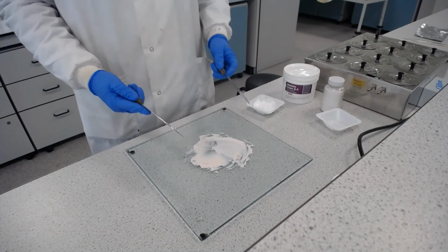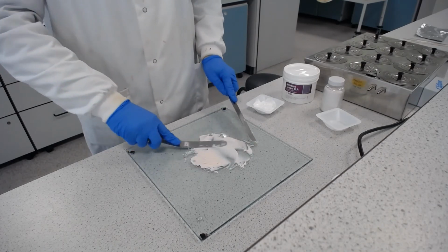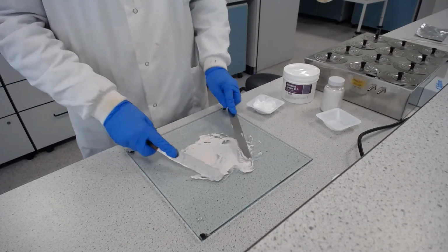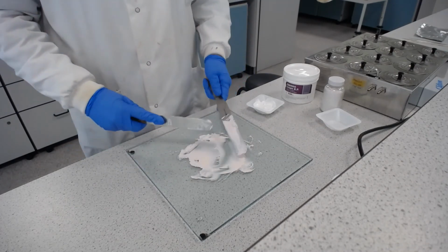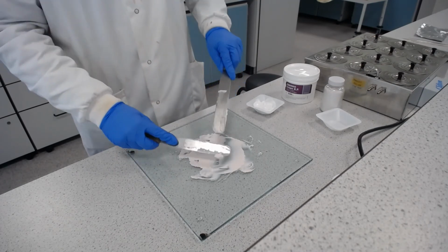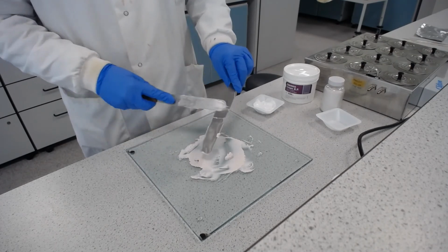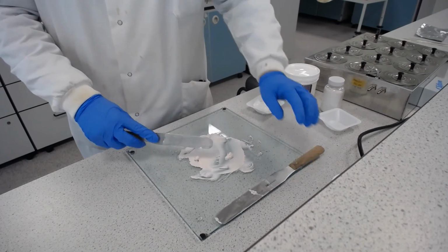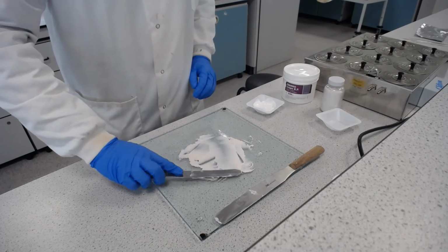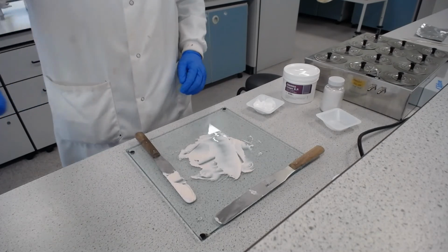Or if you've got a larger amount of cream and you've got a big enough slab and you want to do this job quicker, you can start doing a 2 palette knife technique. Now, if you're not comfortable doing that, that's absolutely fine. It might just take slightly longer for you to get to the desired result. Now what we need to do here is we need to make sure that the grain size goes down sufficiently small that we can't see any traces of dragging in the cream. And I'll just show you what I mean by that.